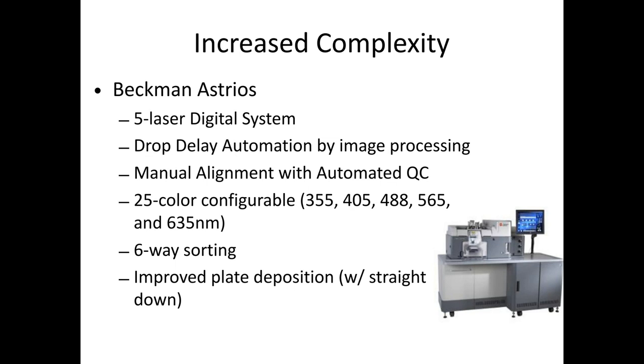But the thing I liked most about these 2 systems and the MoFlo before was the improved plate deposition. It was a very smooth piece of engineering with really fine stepper motors that was very accurate. And that combined with sorting straight down, instead of sorting a deflected droplet. We instead would bend the entire waste stream to the right and just sort whatever we wanted straight down, made it super accurate. So we could start doing 384 well plates. This was really cool. So this is one of the features of this piece of instrumentation that was really useful in our hands in the core.